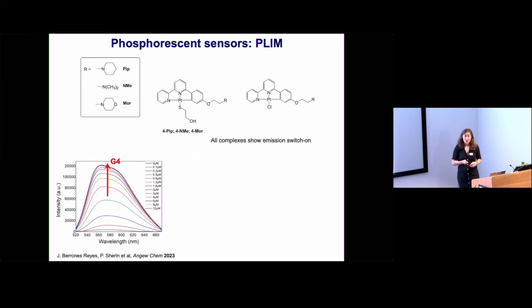Okay, so I have some time. This dye that I talked about was a fluorescent molecule. So this is great, but if you want to use your probe alongside, let's say, GFP or another common fluorescent marker, then you might want to do some multiplexing to allow you to image, let's say, FRET using a fluorescent marker, and quadruplexes using some other technology. So we decided to look at phosphorescence, which is a similar phenomenon to fluorescence, except it involves triplet state decay. And as a consequence, it's about 100 to 1,000 times longer. So it happens at a completely different time scale.